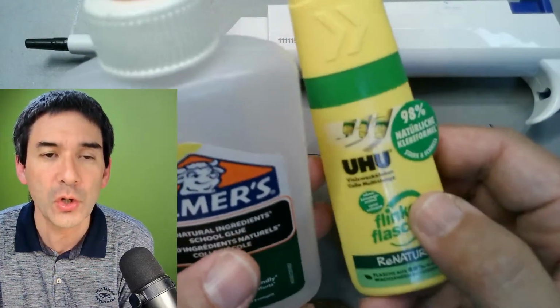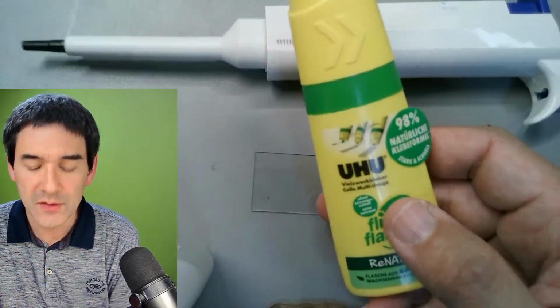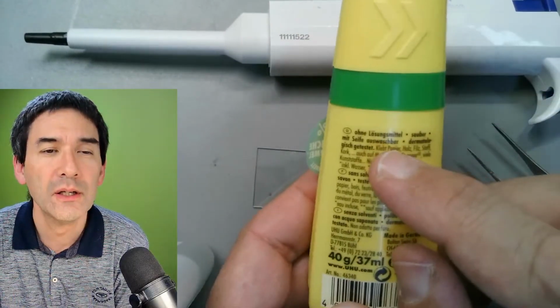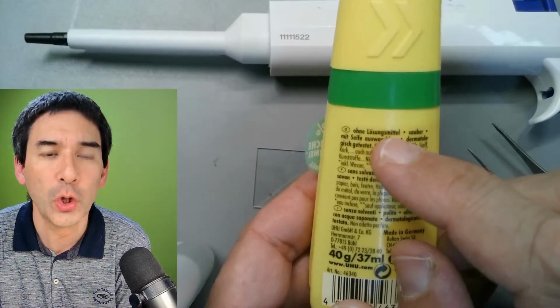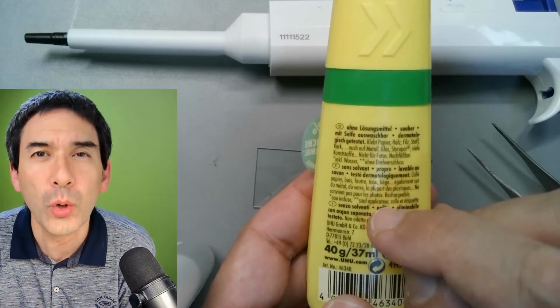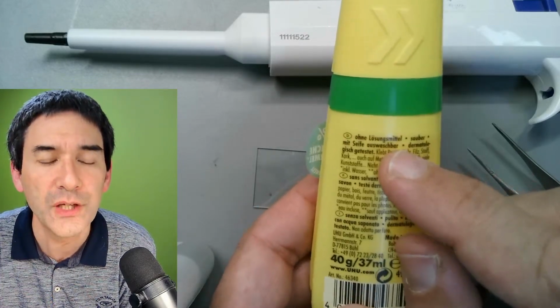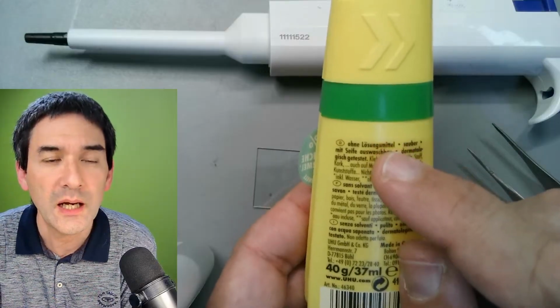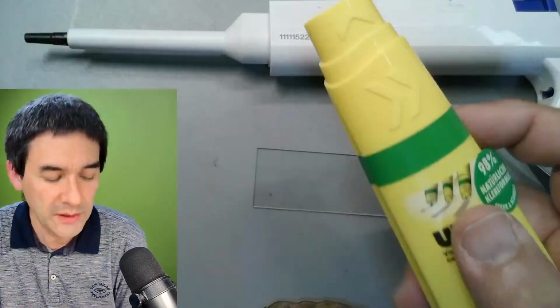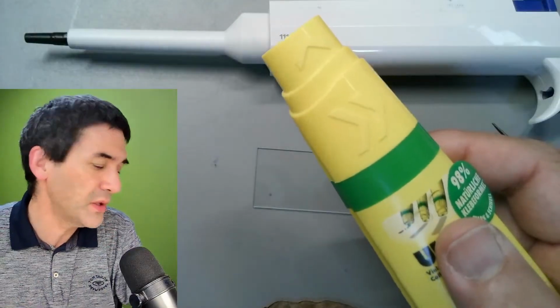It says in the back here that it's free of solvents. Well, actually, the solvent is water. What they actually mean is it's free of organic solvents. So it's a water-based glue, just like this one, and therefore it's also quite suitable.